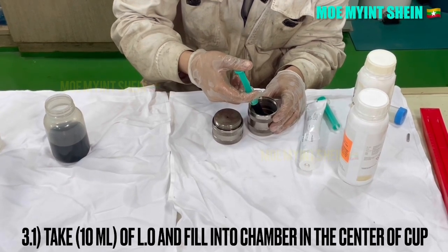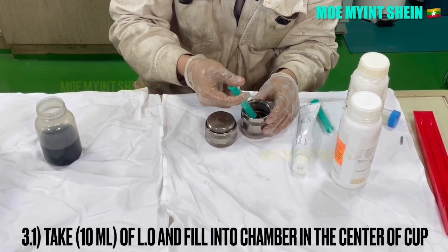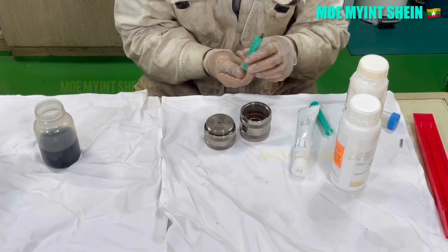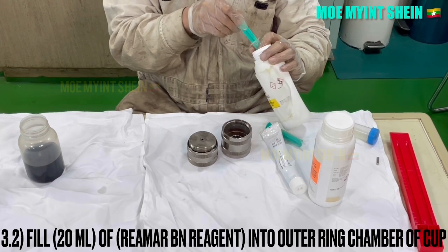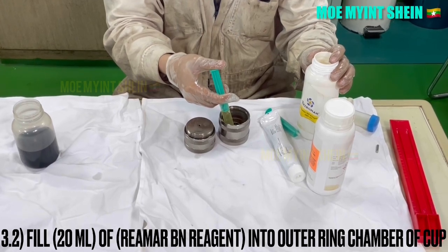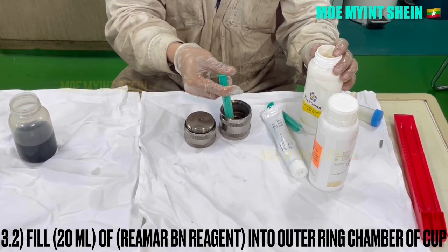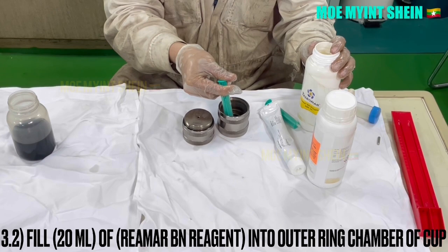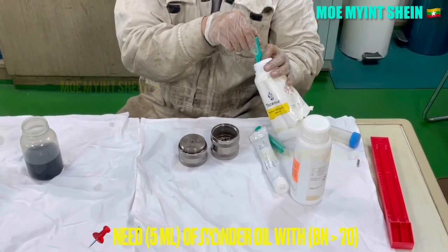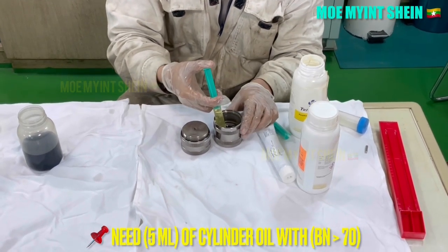Take 10 milliliters of lube oil and fill into the center chamber of the cup. After then, fill 20 milliliters of Reamar BN reagent into the outer ring chamber of the cup. If the base number of the lube oil is greater than 70, you need only 5 milliliters of sample.